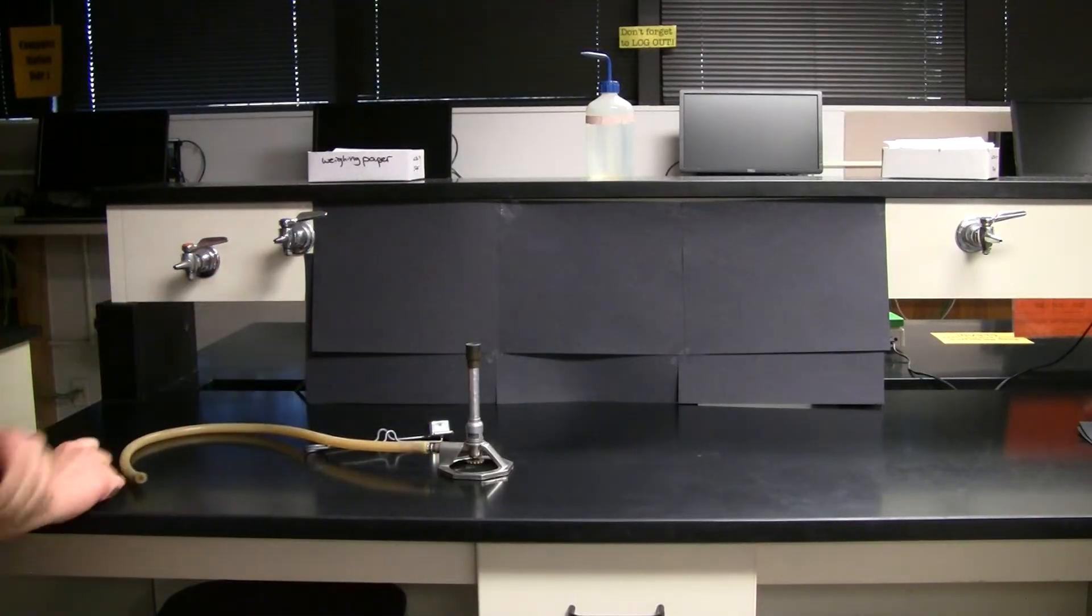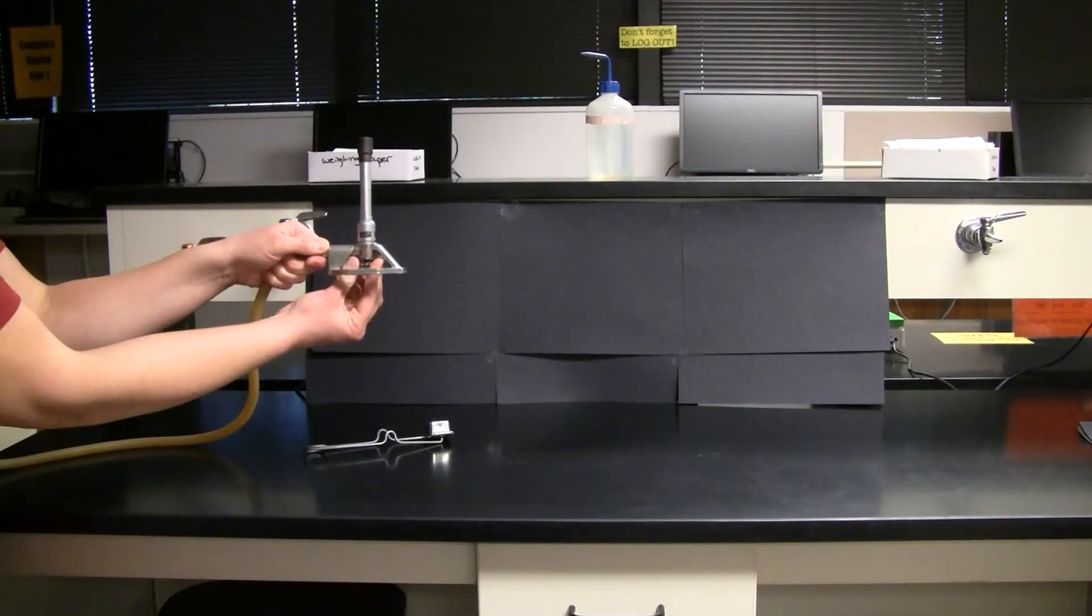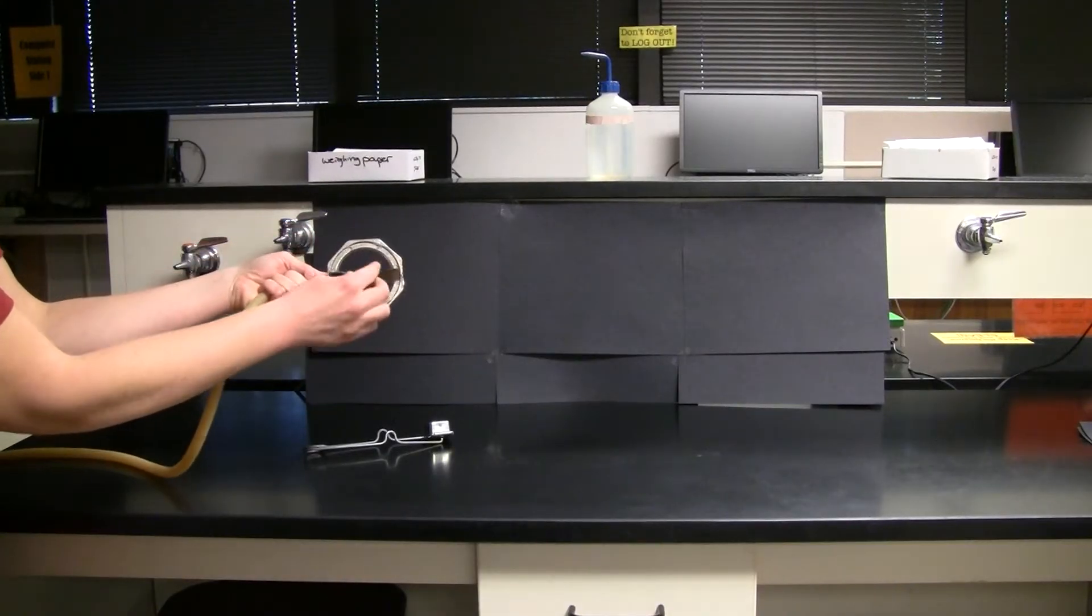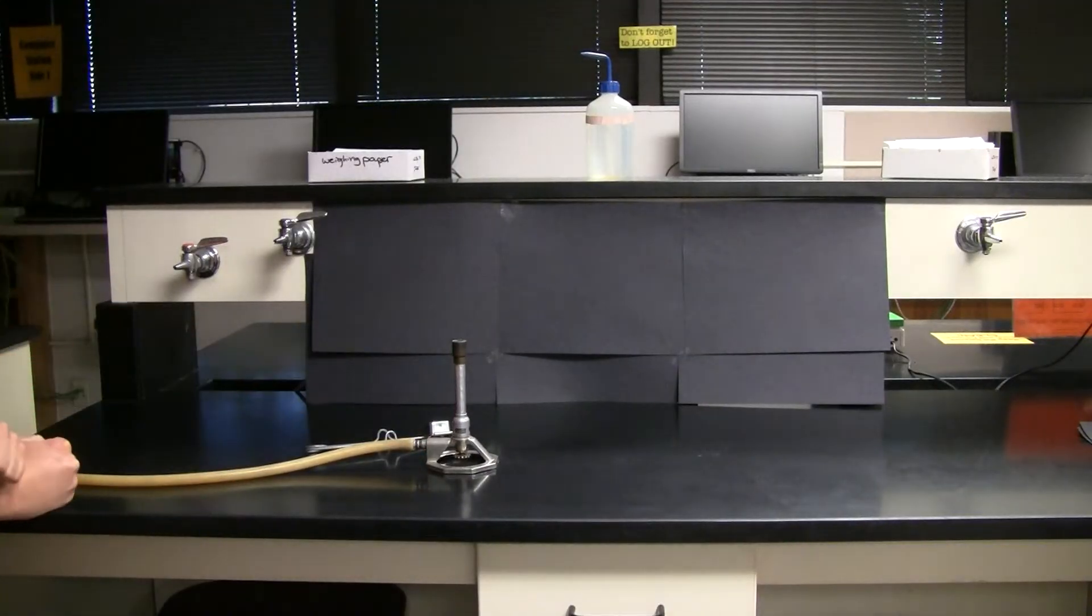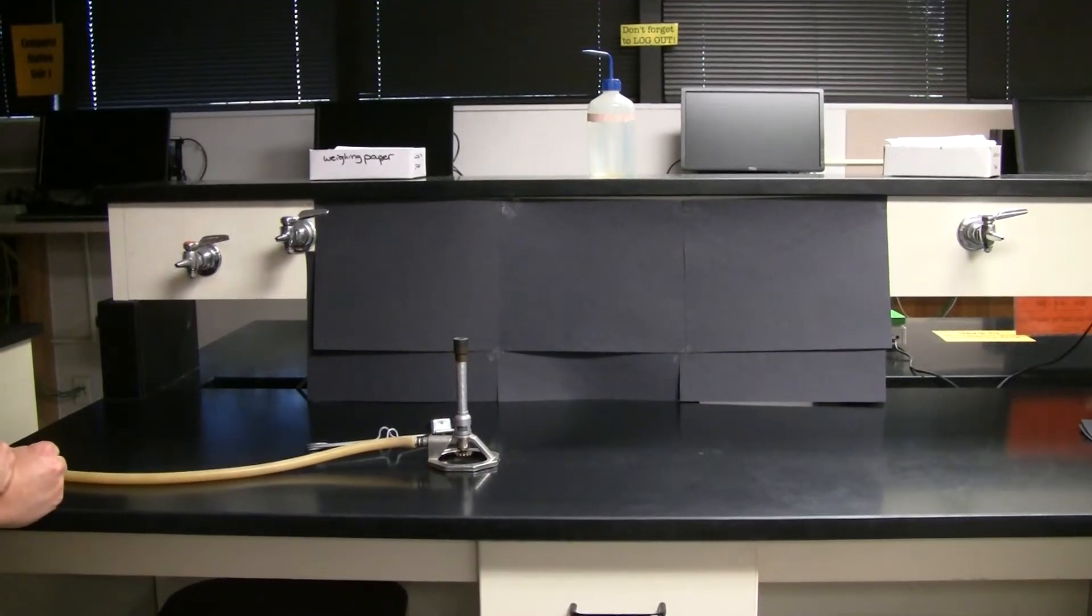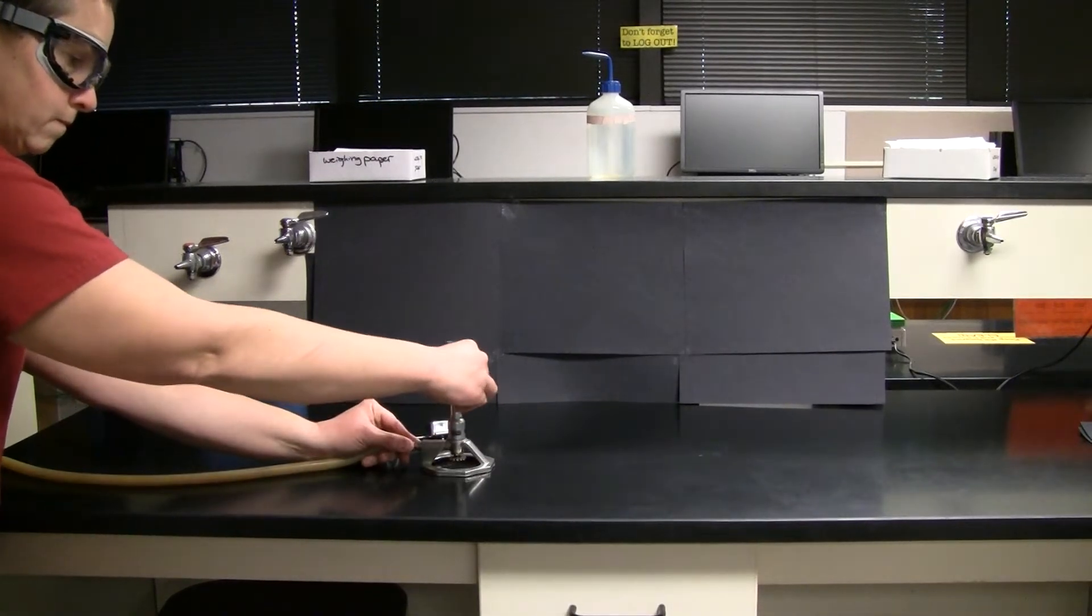There are two valves on this Bunsen burner. The bottom valve is a needle valve that controls the gas inlet. Make sure that gas valve is closed. The upper valve along the barrel of the Bunsen burner is an air inlet. Make sure that valve is closed as well.